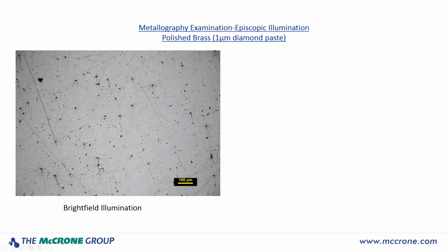Some of these dark specks have what we call comet tails coming off of them, like they're smeared a little bit, kind of a smearing action. We can also see some heavier scratches that also are kind of parallel to these little smearing things. So this sample needs to be polished a little bit more. It hasn't removed all of the artifacts from the previous grinding and polishing steps before it got to the 1 micron diamond paste. But it illustrates what you see with these types of illumination.